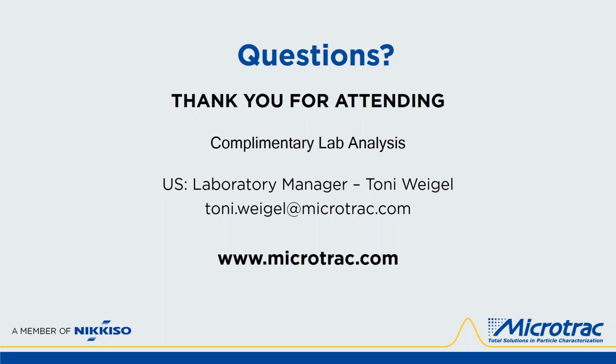I would have to say that there's a difference between at-line and online. Online is when you're taking a sample from the process stream on a regular basis, like at an interval of every 10 minutes and getting a new result, and it's all automatic. At-line is when you're sampling the stream and making a run right there on the process floor. So we only have the laboratory version. It would be an at-line version or running the sample in the laboratory.